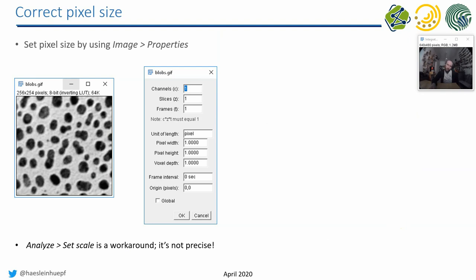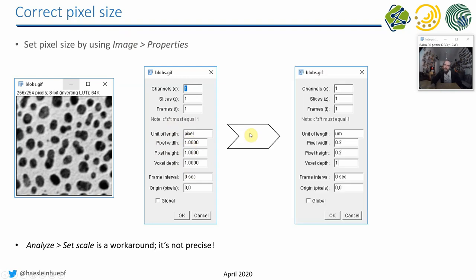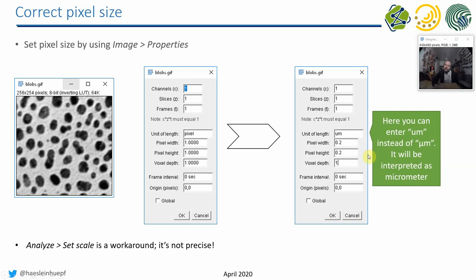You sometimes have to correct the pixel size when opening a dataset. If the image shows 'pixels' instead of 'microns', the import hasn't worked correctly, and you should go to Image > Properties to correct it. Most microscopes these days save images correctly and ImageJ can read them correctly, but in some cases it does not. Also note: the micron symbol may be hard to find on some keyboards, so you can just enter 'u' and it will be interpreted as microns.